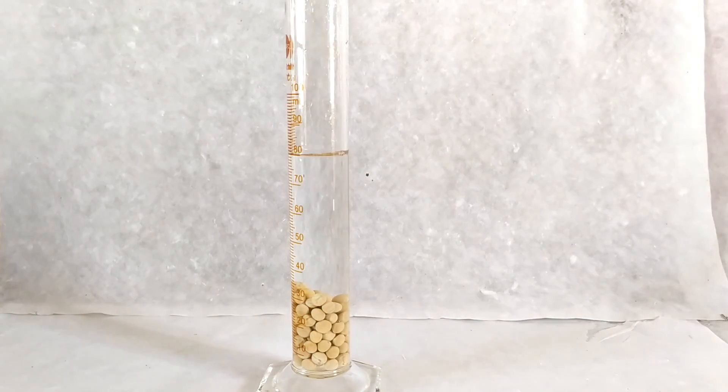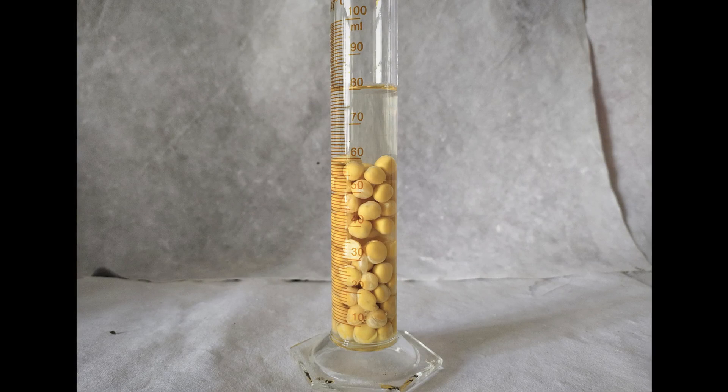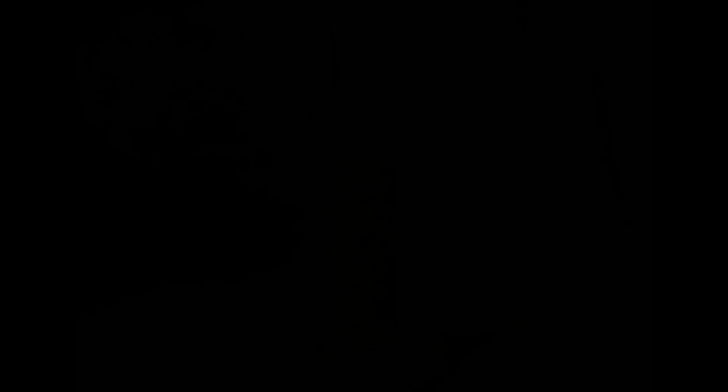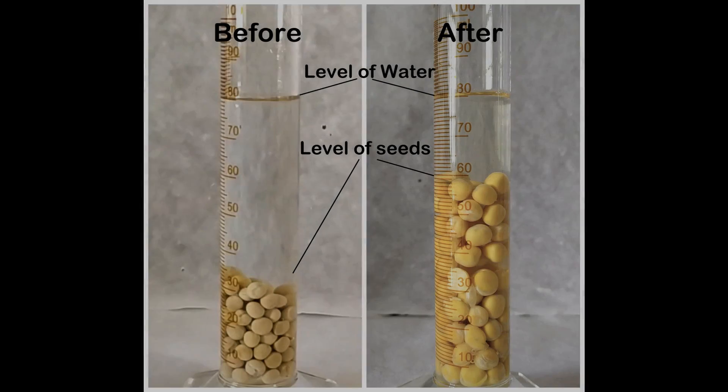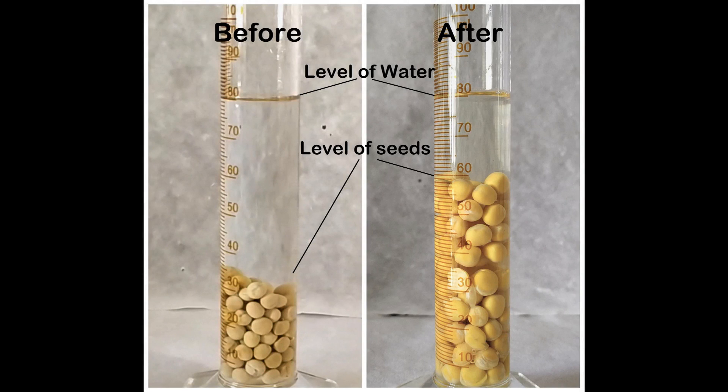Observe the seeds the next day. You'll notice that the overall volume occupied by the seeds and the water in the cylinder remains basically the same. You'll also find that the volume occupied by the seeds in the cylinder have increased about two-fold, while the volume occupied by the water have correspondingly decreased.